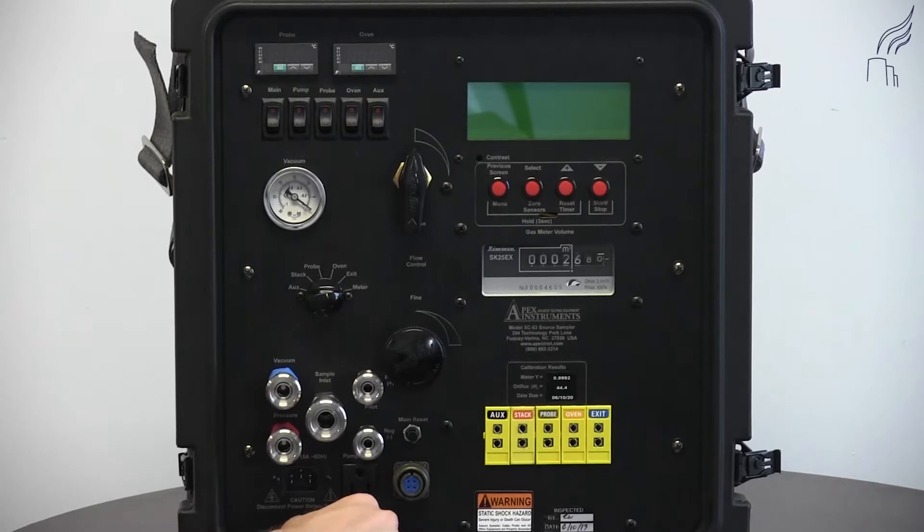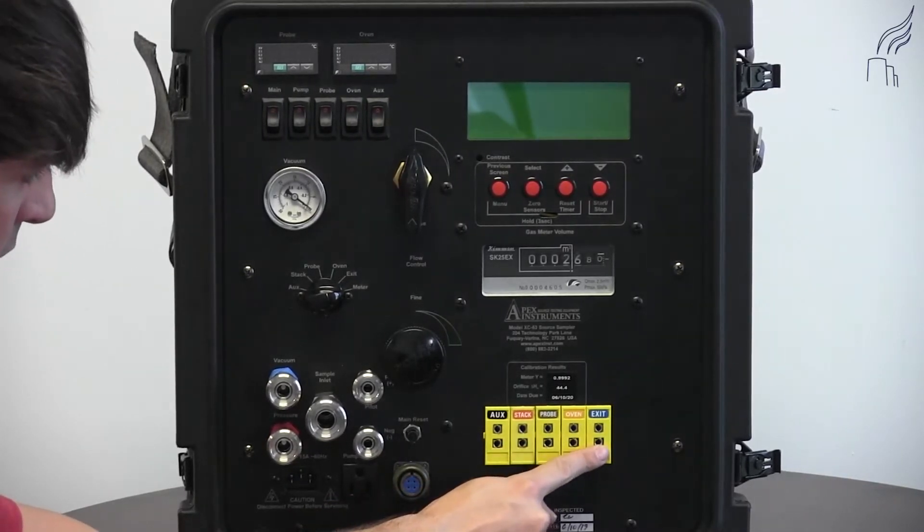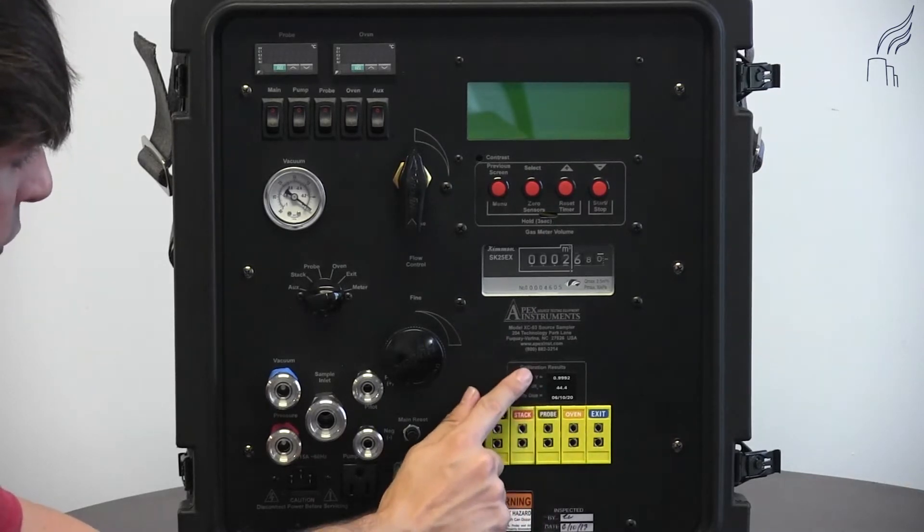On the bottom right of the console, we have our thermocouple inlets. And above this, we have our calibration results table.